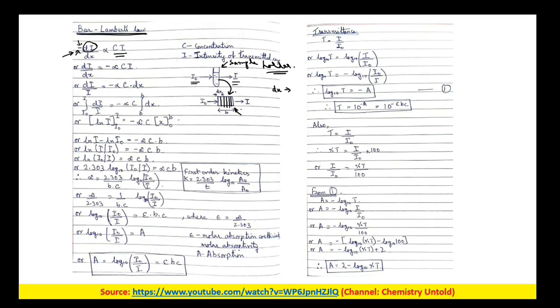Basically the intensity is decreasing with the increase in the distance dx, and it depends on the concentration of the solution and the transmitted intensity.